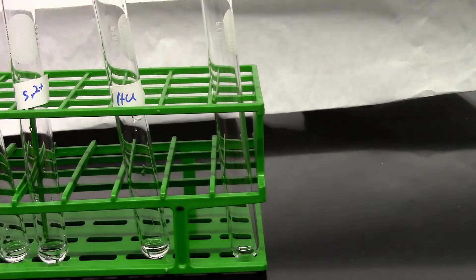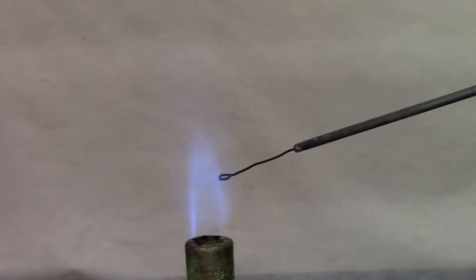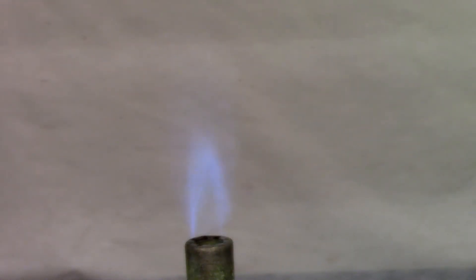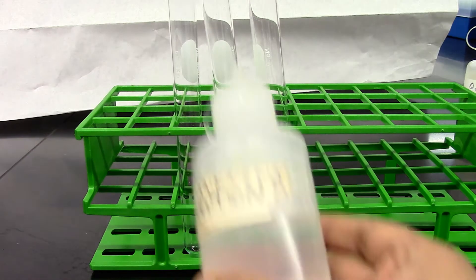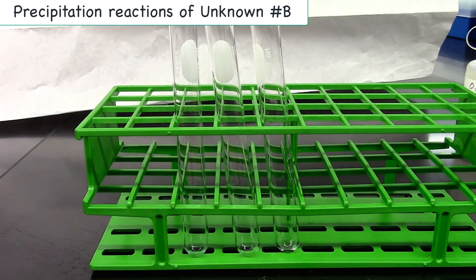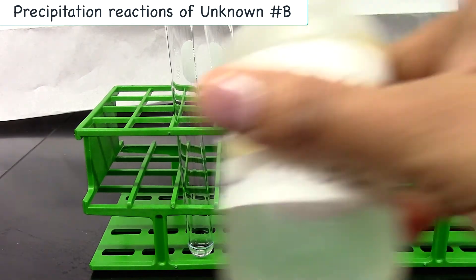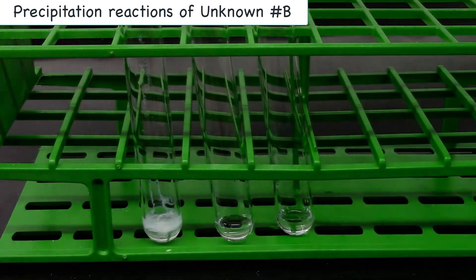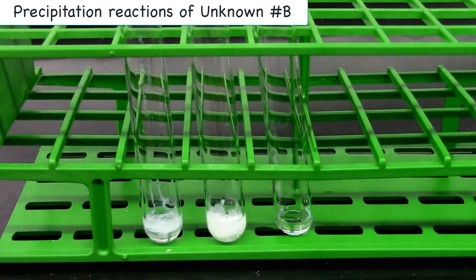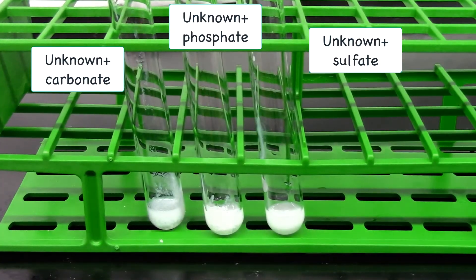I'm going to take 10 drops of metal ion solution for the flame test. Now we're going to do the flame test for our unknown solution. For the unknown I'm using unknown B. I'm going to add 10 drops of unknown into each test tube. For the first precipitation test I'm using ammonium carbonate, second ammonium phosphate, and third ammonium sulfate. The unknown forms precipitate with all three solutions. Record your observation.